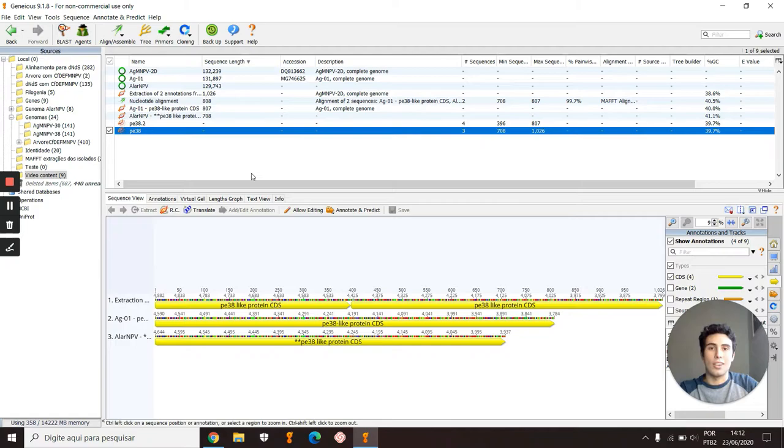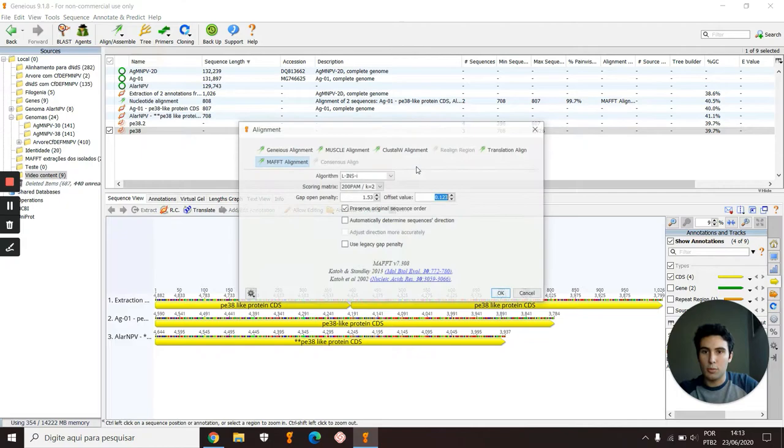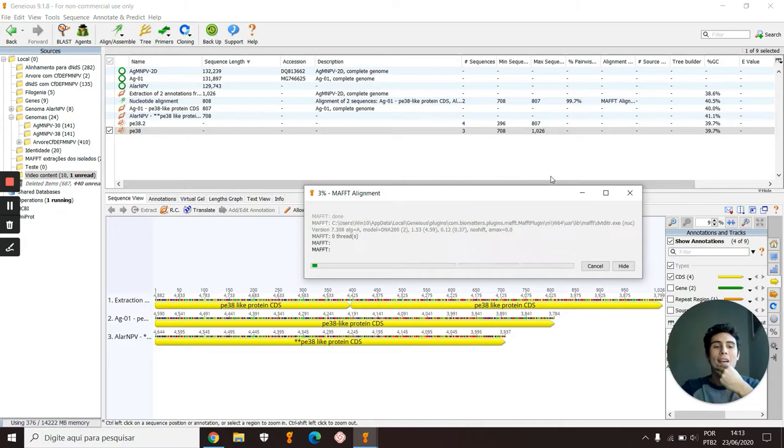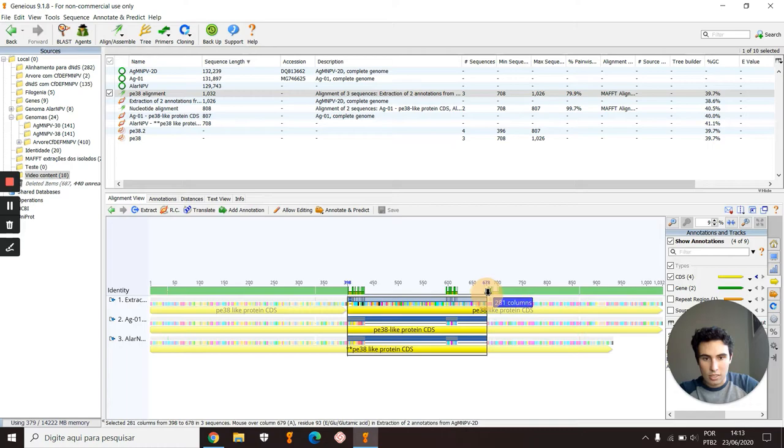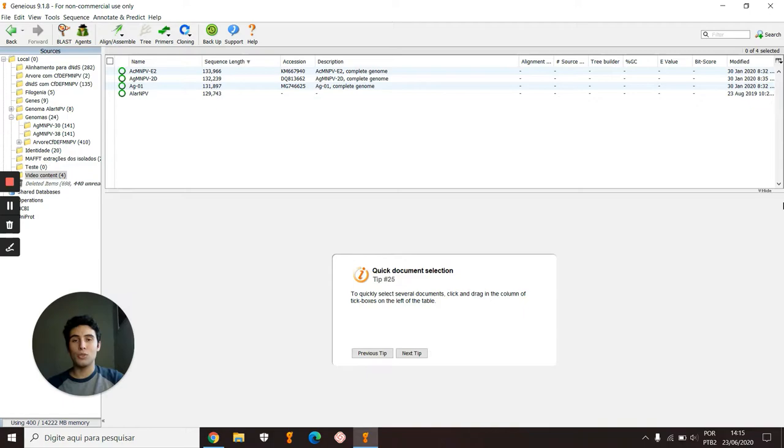And now, for example, I will align it right here in Multiple Align with MAFFT. And that's it. Look at this diversity.